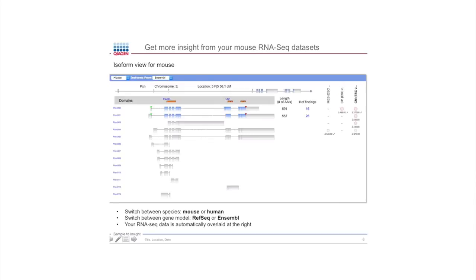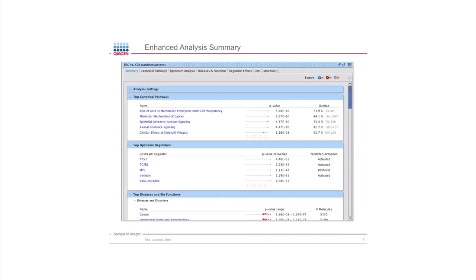And we'll go into this in a lot more detail. This is the enhanced analysis summary. So we've made it look nicer, but more importantly, we've added these little graphs that you'll see that are sort of the scatter plot of the p-values for different categories, because sometimes these things represent a category. You know, there's multiple types of cancer underneath in this category, and so we showed the range before, but now we show you the scatter within that range.